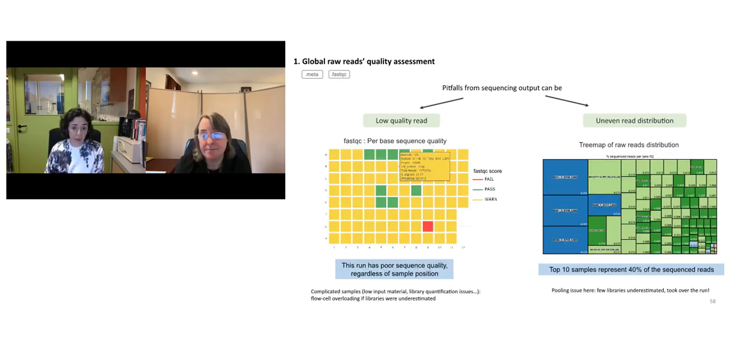And indeed, by using this tool, when you are analyzing, like in our case, 96 samples at a time for each run, you can have the global assessment. So here I'm showing you only the bad situations, because showing the good is not necessarily interesting. You can see that this is a unique run where 96 samples were amplified simultaneously, then pooled together and sequenced in the same run. You can see that for most of those samples there was a warning. One completely failed, and very few passed the quality score from the sequencing, from the FastQC.